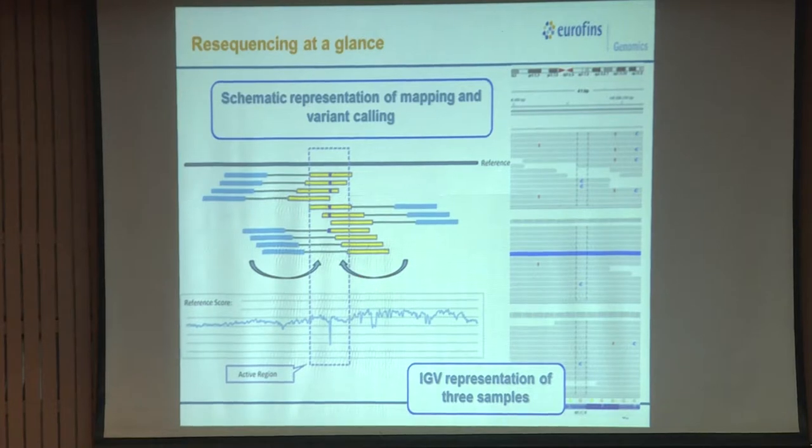Once we map the reads, this is mainly done for studying differences or SNPs. The main objective is, if we want to find out SNPs, biomarkers, then we go for reference seq. If I find a region where my reference sequence has a base and this particular read has some other base, you can see a purple line tells me that there is a different base there. The reference and this purple line have a different base. So I will call it an SNP, right?